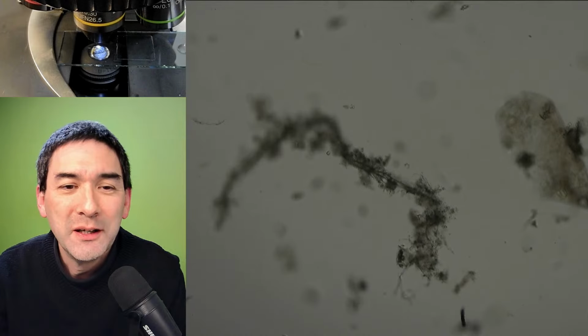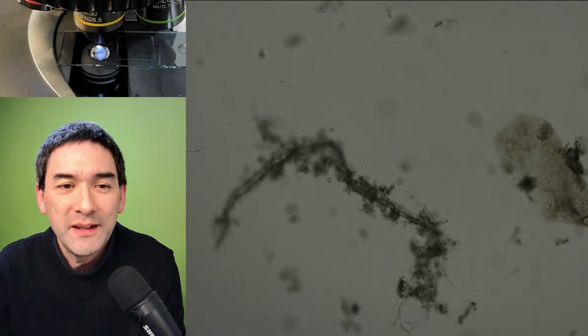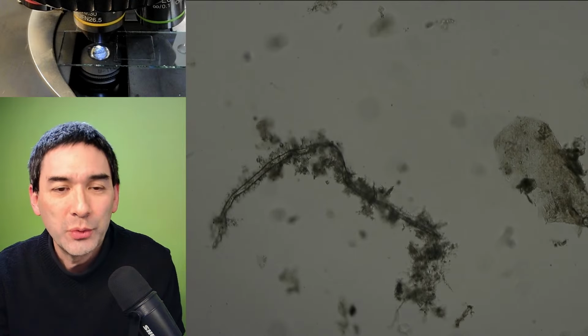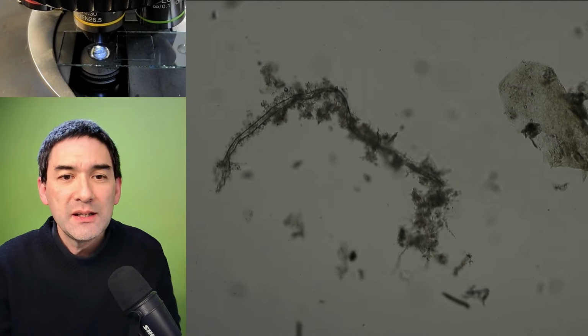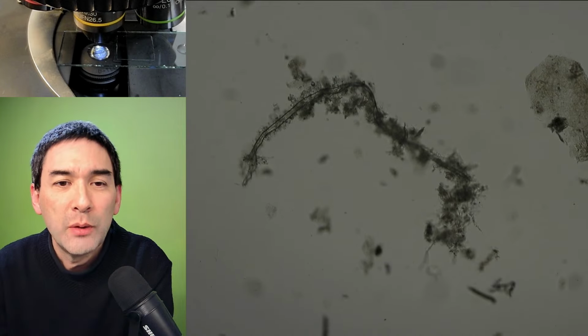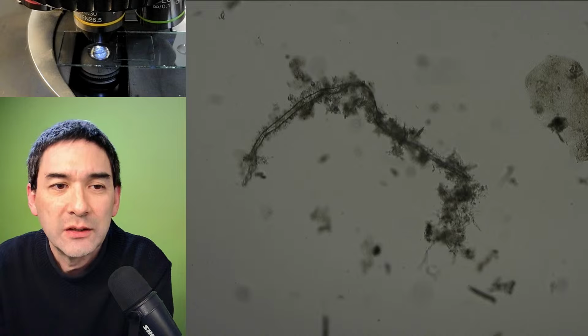Okay, yeah, but here we go a little bit here. It's a little bit better. A lot of gooey stuff, and this is actually the thing that I also wanted to show you. Some of the fibers, what you see, they seem to aggregate and accumulate other things as well. So you see that there are other particles sticking on the fiber.